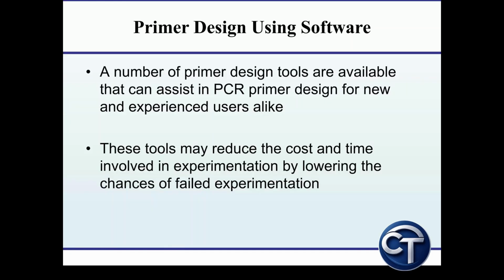So the first step is to obtain the DNA sequence. This is usually done from biological databases. The accuracy of the sequence is very important because any error in the sequence will result in incorrect primer design. Thus, always verify the sequence before proceeding.